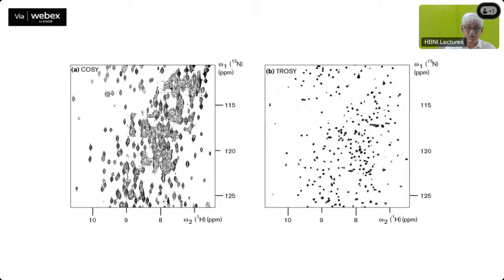And you see here, this is an even larger protein system. This is about 130 kilodalton protein. And this is the normal HSQC. And look at this, TROSY. It's a phenomenal improvement in the line widths by doing this relaxation optimized experiment. And remember, this will only work if you are working with large proteins. If you are working with a 10 kilodalton or 5 kilodalton, no point. You are actually wasting time. There is no significant improvement in any of the 4 components of the 4 peaks. You don't need to decouple. Then you can decouple better, you get a better intensity.